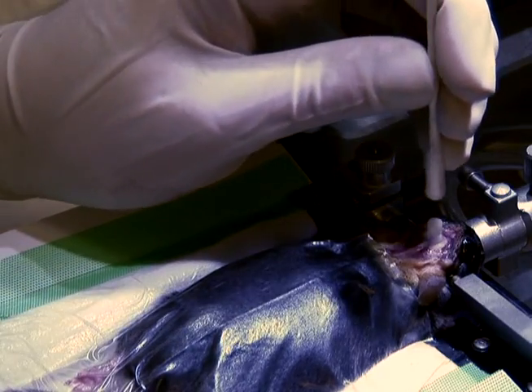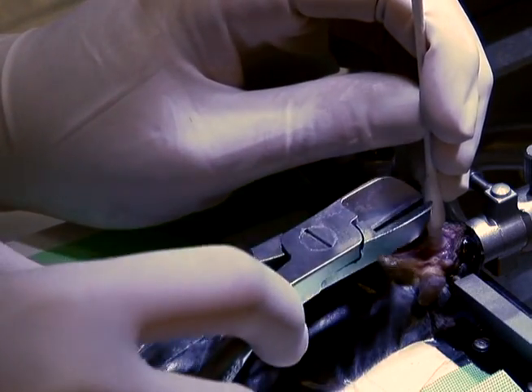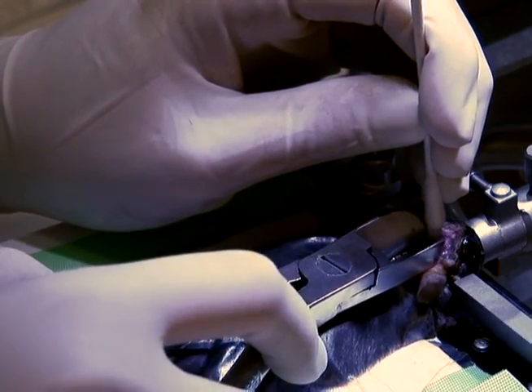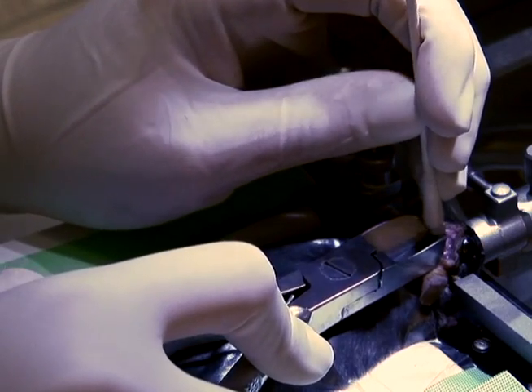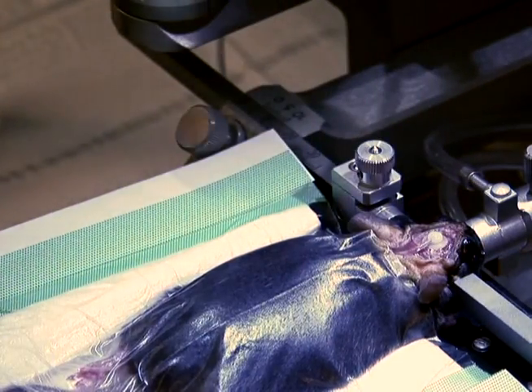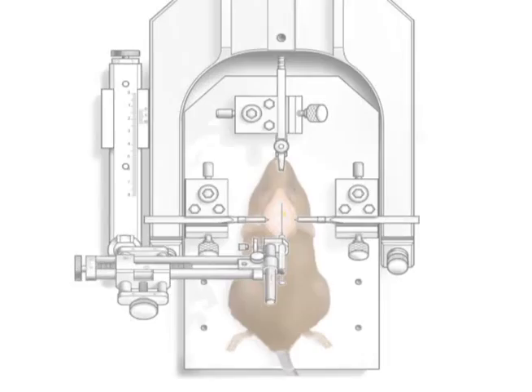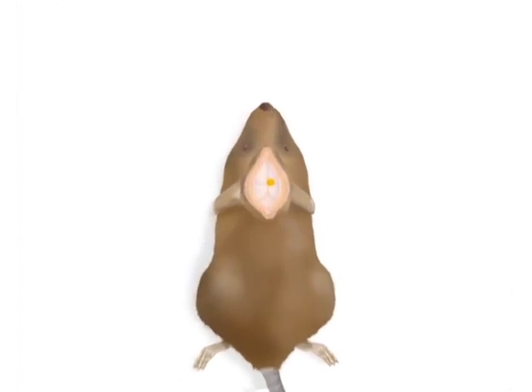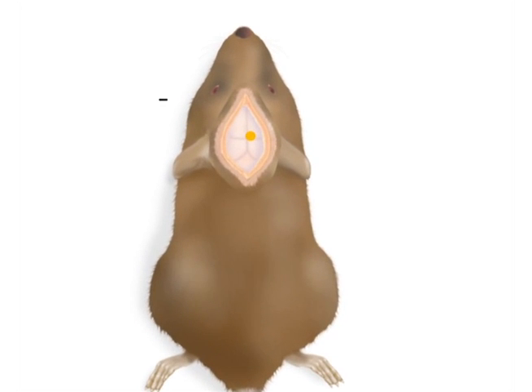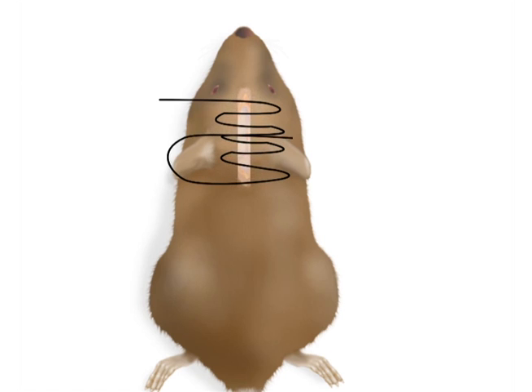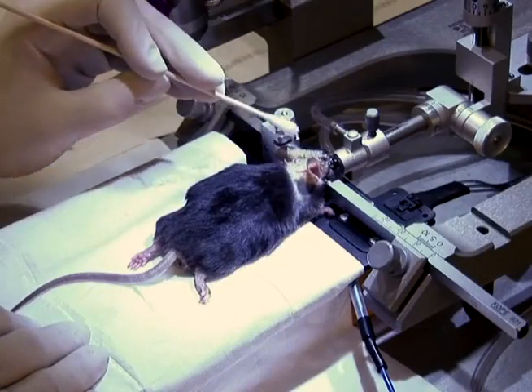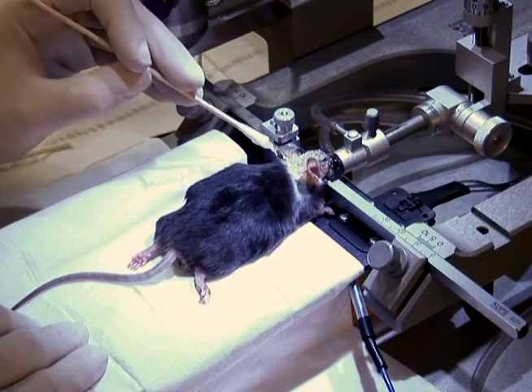Use a cotton swab to press down on the top of the cannula. Fit the sterile rat bone clippers into the groove between the top and base of the cannula. With the clippers level to avoid detaching the cannula from the skull, clip off the top of the cannula while still pressing down with the cotton swab. Using the 5-0 nylon suture, regular hemostat, and forceps, suture along the full opening, paying extra attention to the area over the cannula. Apply a dab of antibiotic ointment over the head and neck.